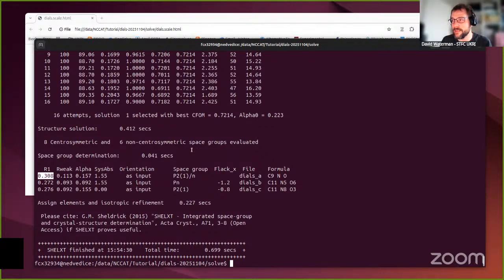But as Tim and others have presented, it's acceptable for MicroED. Certainly at the very initial point of structure solution, with proper refinement we would be able to bring that R1 down, and also fix the atom assignment, because that's likely to be wrong. Let's look at the solution.